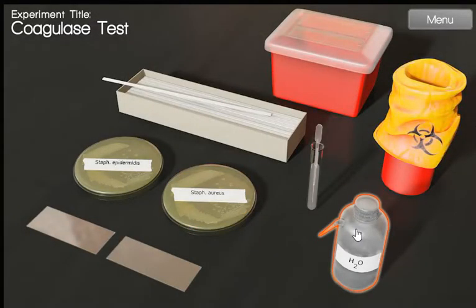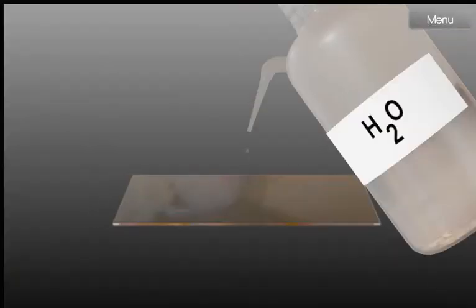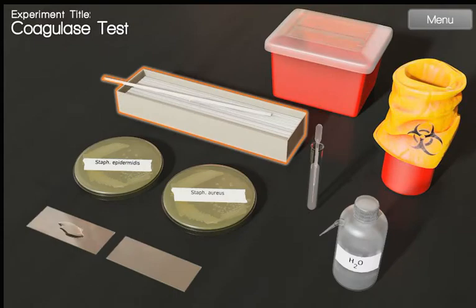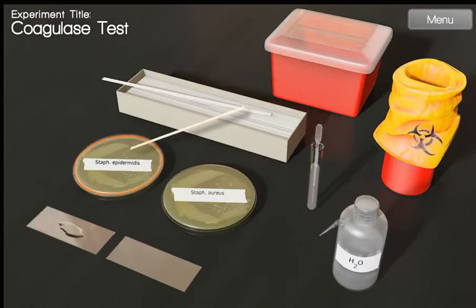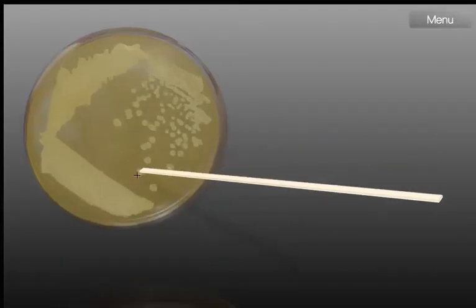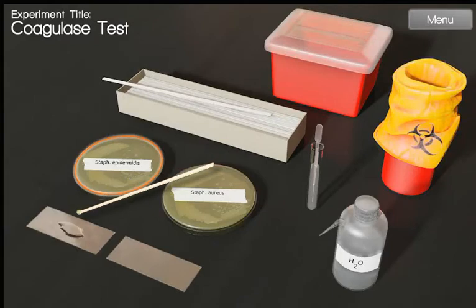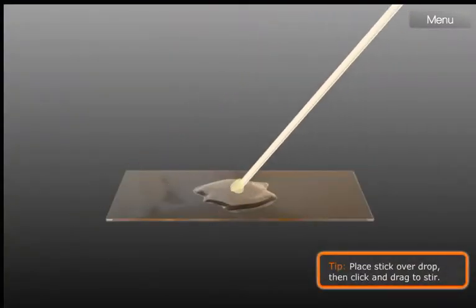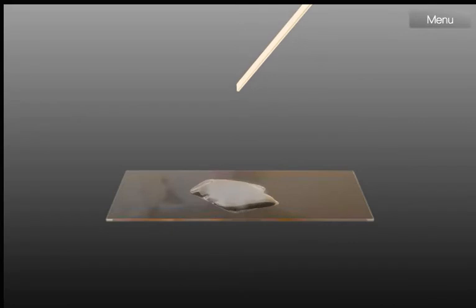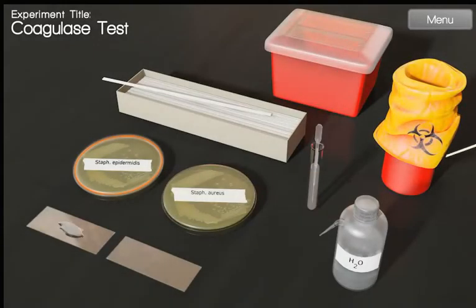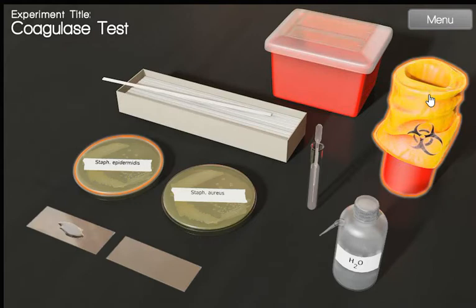First of all, we add water on the slide. After that, we take a stick, choose separate colonies of Staphylococcus epidermidis, mix it, and put the stick in a biohazard container.